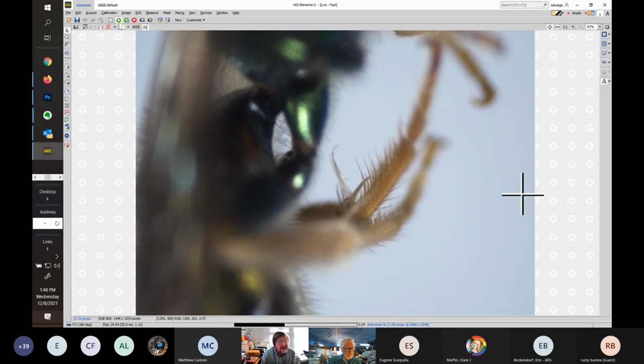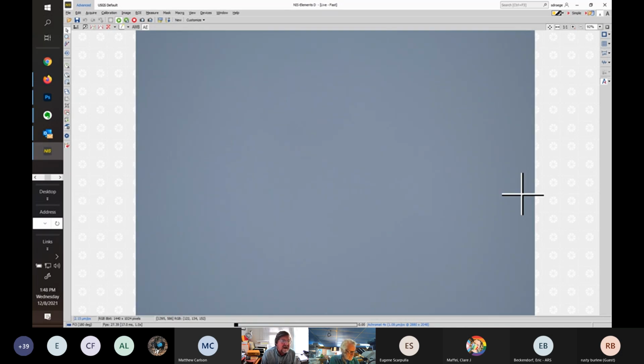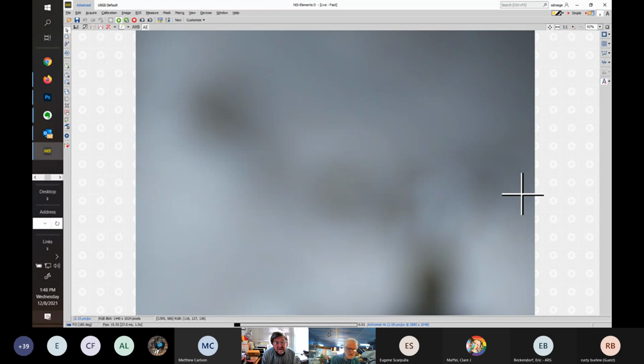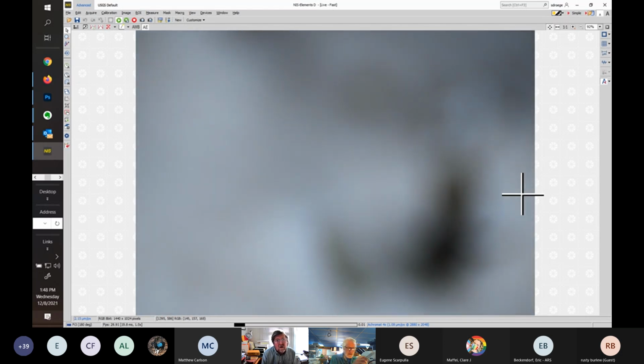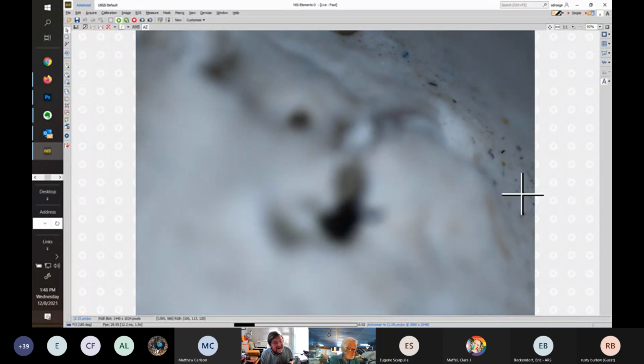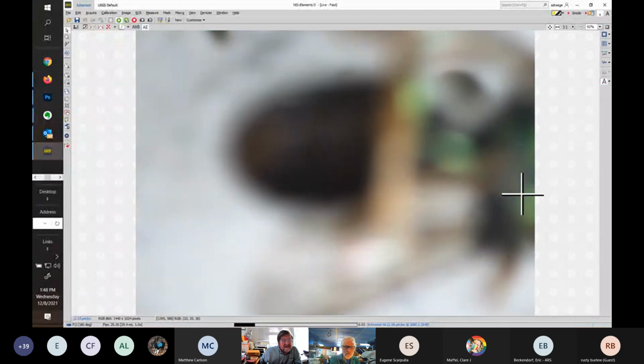Another thing, I don't know if you can see sternite 3 on this, but in gratiosa the posterior margin of S3, sternite 3, is relatively strongly concave or incurved compared to aurata and persimillis. But it should be pointed out that that is a character of the genus in general. Yes, the incurved, but it's particularly strong in gratiosa. But again, if you didn't see the other two, you wouldn't necessarily know that.